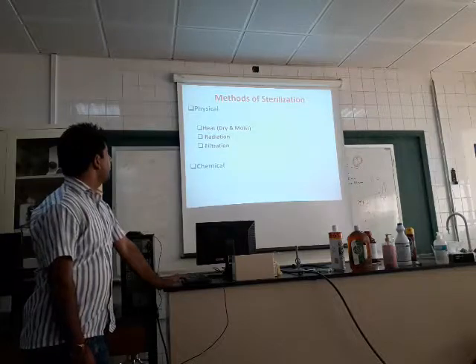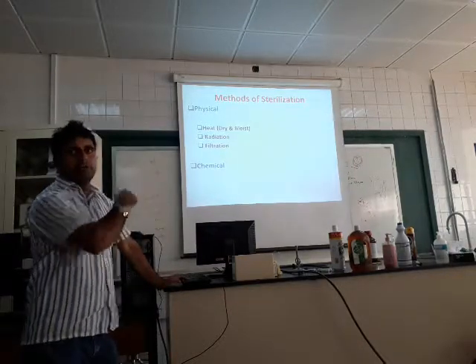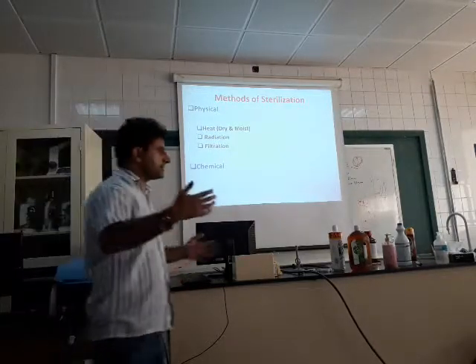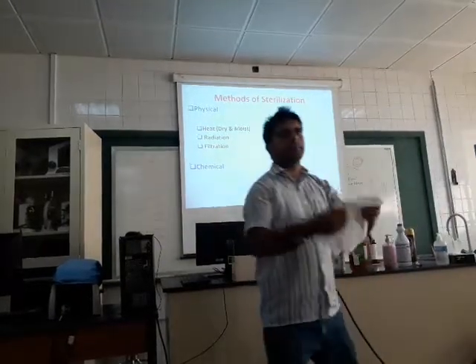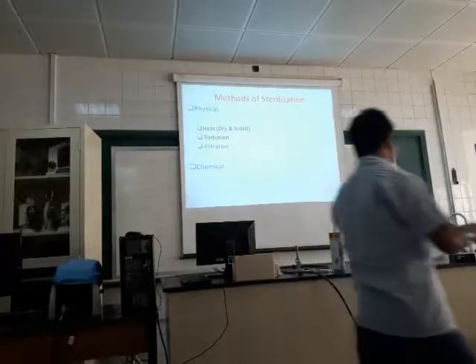Physical methods: heat, radiation, filtration. Oh, filtration I didn't mention, I'm sorry, I forgot about it. Filtration means you are filtering something. Now, in the market, filter papers are available.